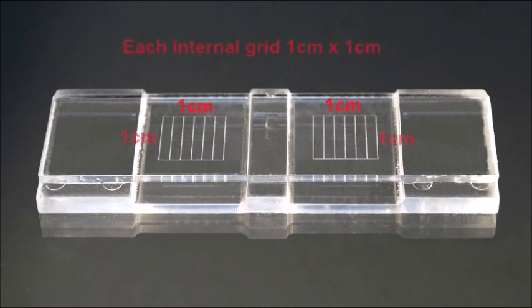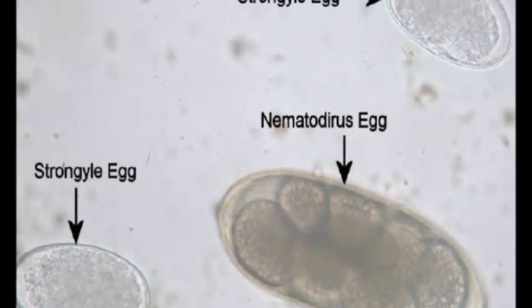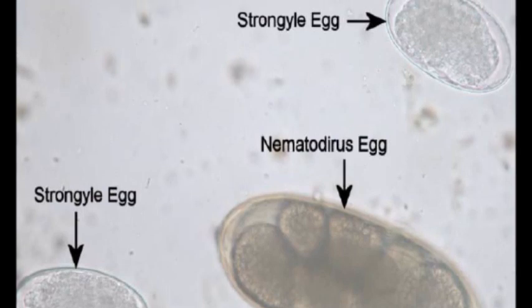The McMaster chamber has two compartments, each with a grid etched into the upper surface. When filled with a suspension of feces in flotation fluid, most of the debris will sink while eggs will float to the surface and can easily be counted under the grids.